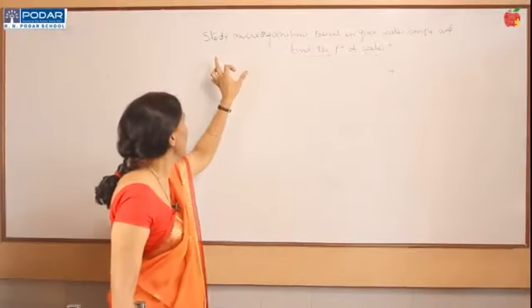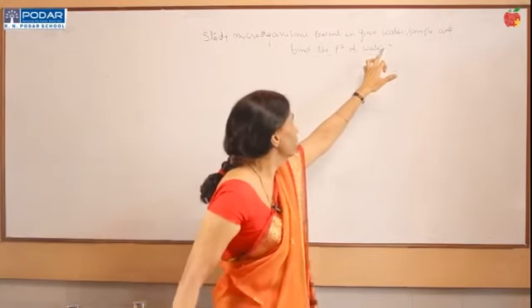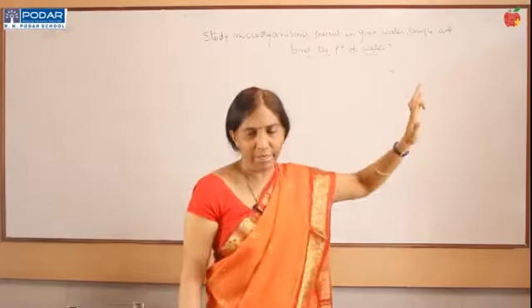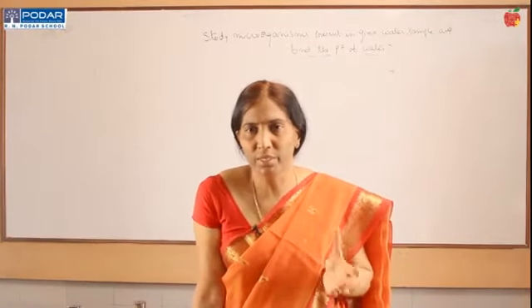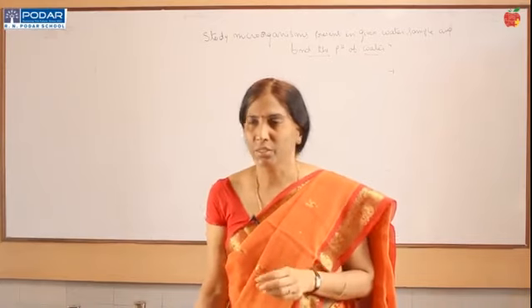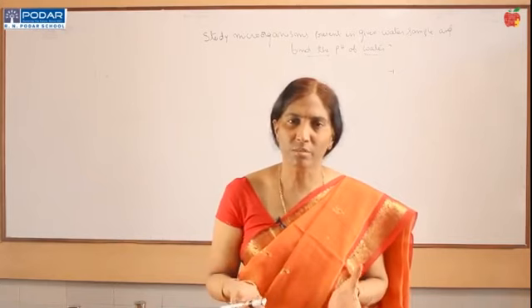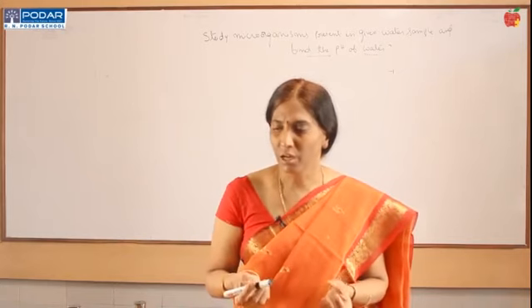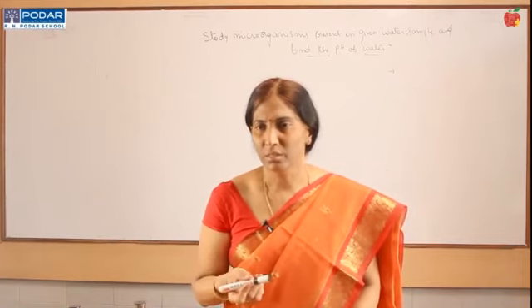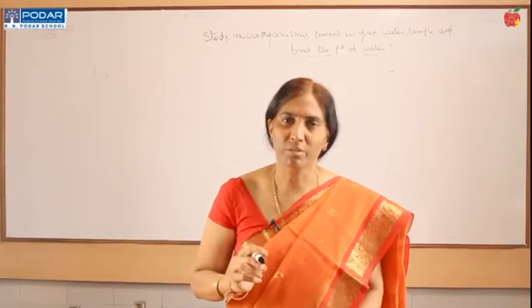This experiment aims to study any microorganisms, if at all present, in a given water sample, and also to find the pH of water. Here we are taking two water samples: one is pond water and the second one is normal drinking water or tap water. Take a drop of both water samples on a clean slide and observe under the microscope, and then prepare the slide with the help of safranin and glycerin with a cover slip, make a permanent slide and observe under the microscope.